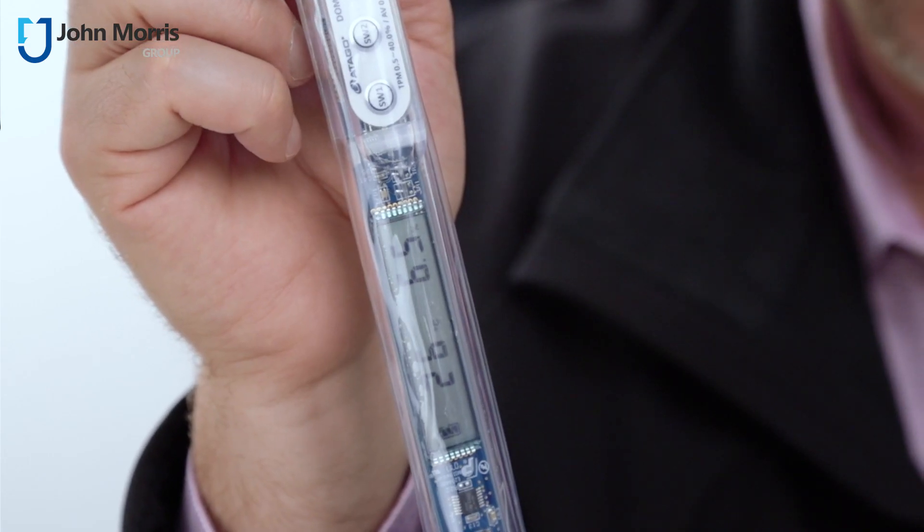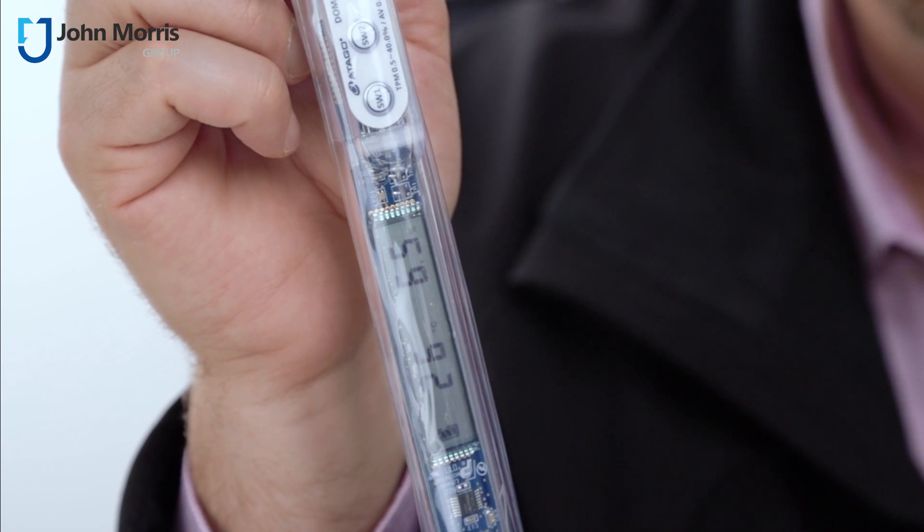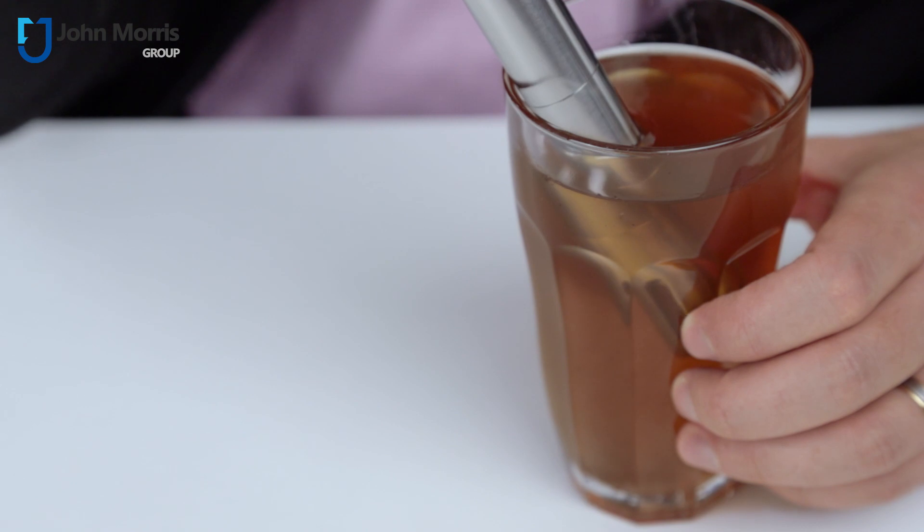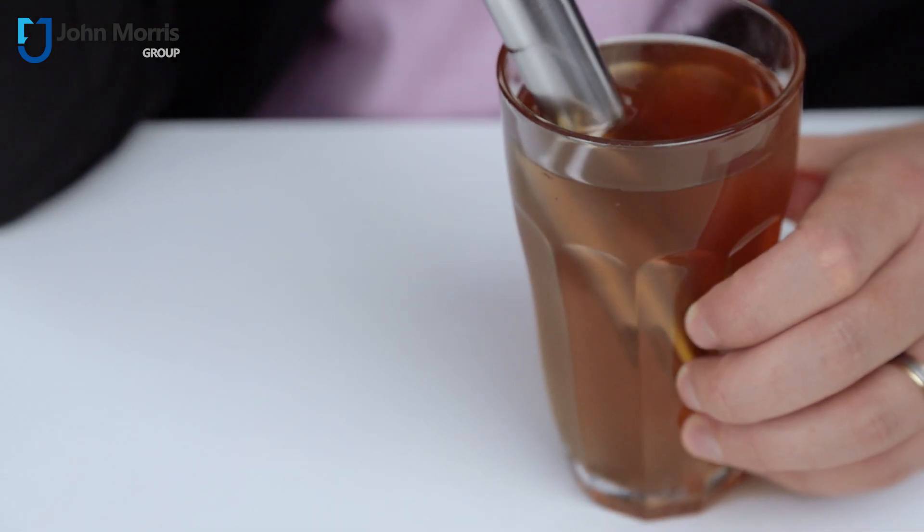So here you can see that we're at about 26 degrees with this oil, and the TP value is about 6.5%. This oil is clearly good to use, as we'd expect because it's brand new.